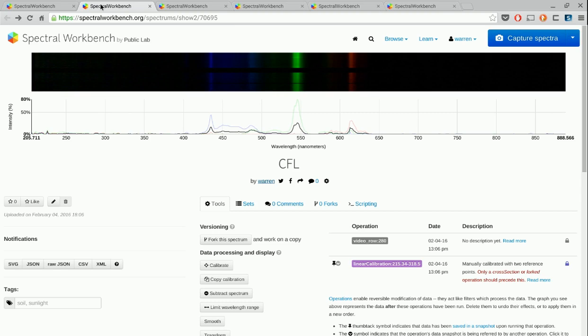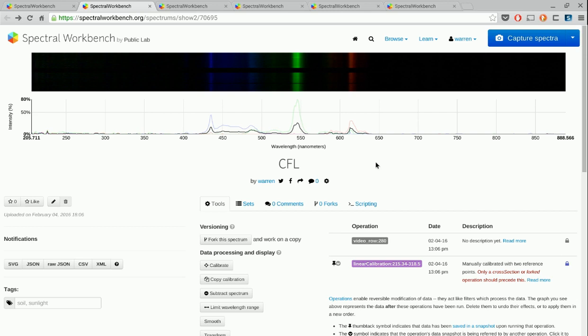We use a compact fluorescent light bulb. And this is one of those that looks sort of like a corkscrew, and it fits into a standard Edison bulb socket. And it's one of the ones that's a bit warmer in color. Now, when you take a spectrum of that, unlike daylight or incandescent bulbs, you'll see that there are these really distinct peaks.